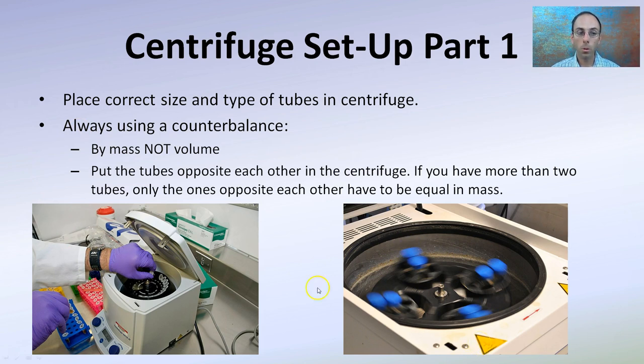If you have more than two tubes, only the ones directly opposite each other need to have equal mass. So these two can have equal mass and these two can have equal mass — it does not mean all four have the same mass. The ones directly across from one another need to be equal. Sometimes you load the entire centrifuge for one experiment, and that's fine as long as the masses are right around the same.